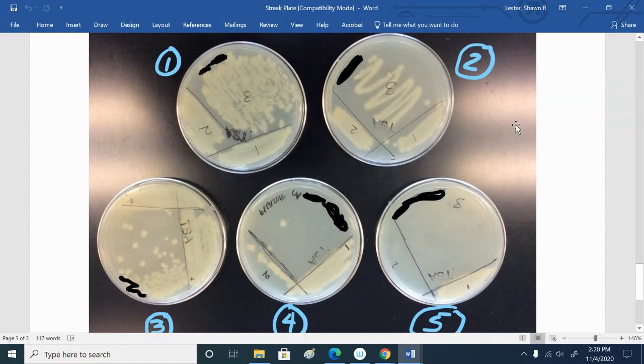What about plate number 2, good or bad? Bad. Yeah, bad, it's even worse, right? Clearly, there's no connection. They're 3 separate zones, right? And again, students do this every semester, right? Even though the instructions say, even though I demonstrate 1 loopful, they grab 3 loopfuls, 1 for each zone.